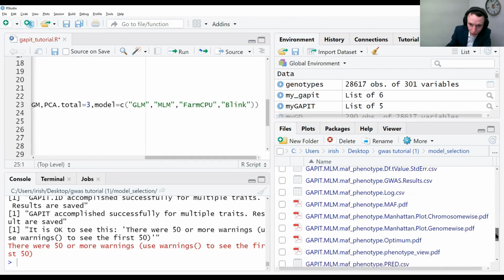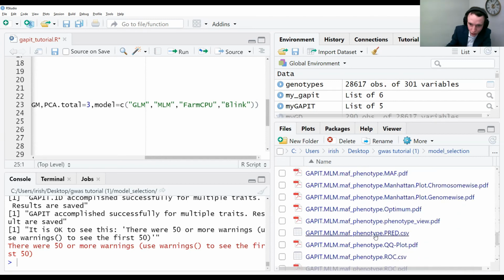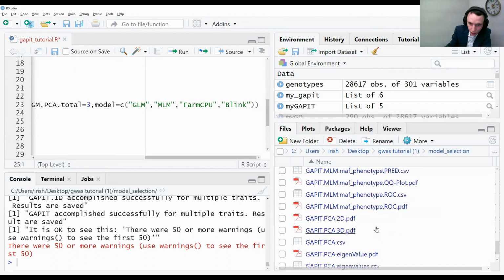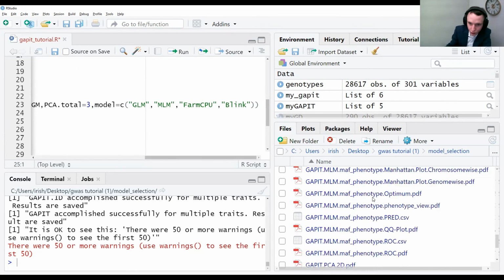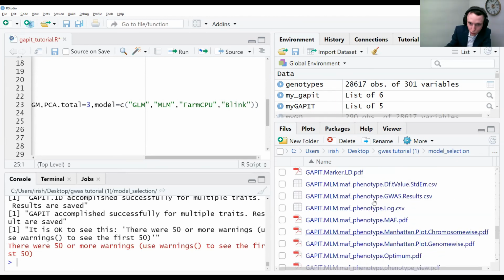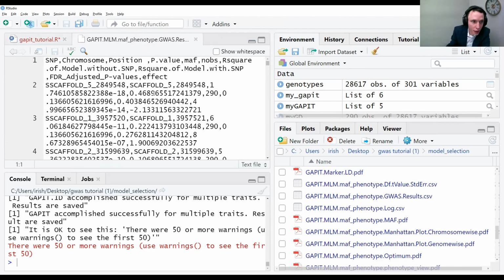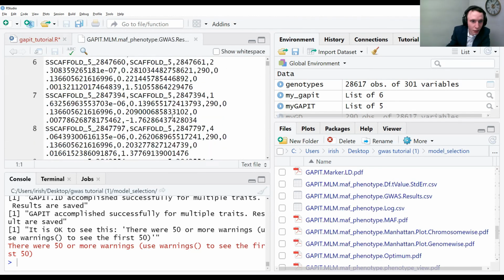What I want to find, I think, is... why is my brain slipping here? I called it the association table. Results, there we go. View file. See if that loads. That does not load very well. Okay.